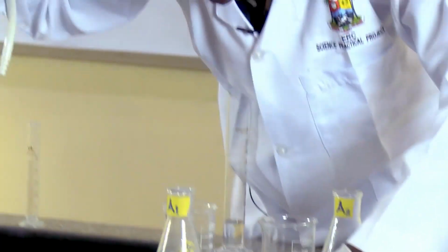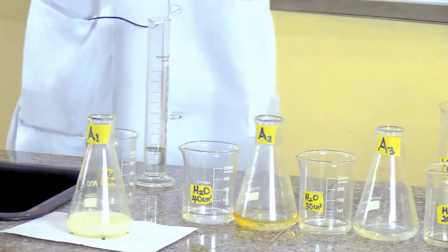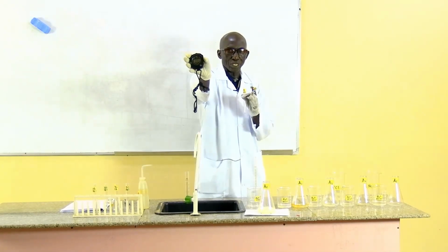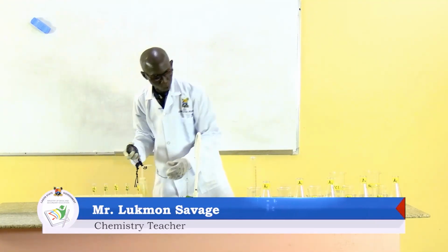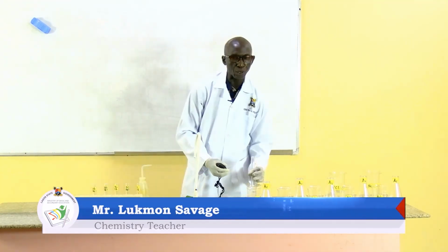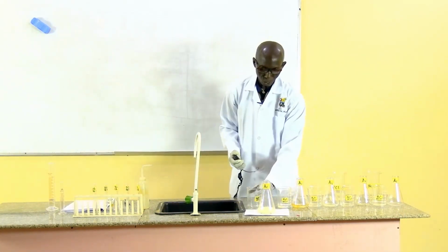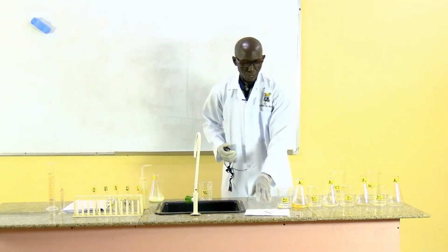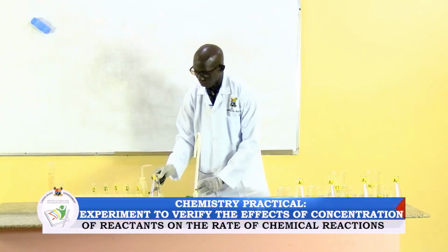1, 2, 3, 4, 5. Stop. I have 5 seconds, 5 seconds for the cross to disappear here. That is for the first one. For the second one, let's go to the second one. Of course, let me take this away from here. So for the second one, I've taken the time. It takes 5 seconds for that reaction to come to completion.